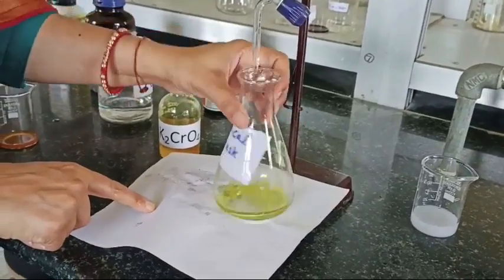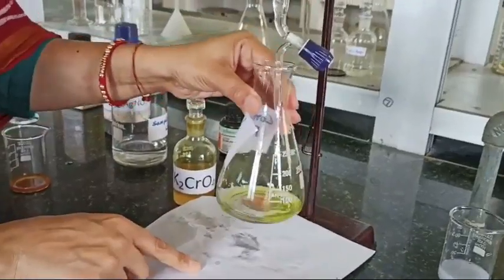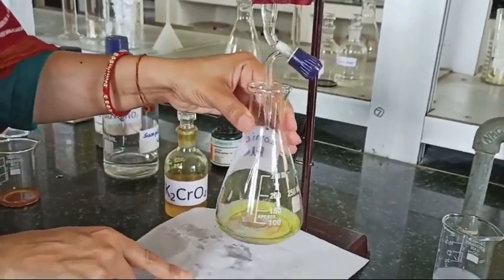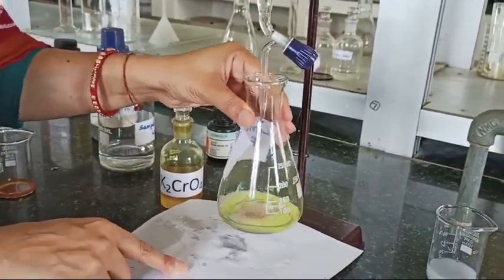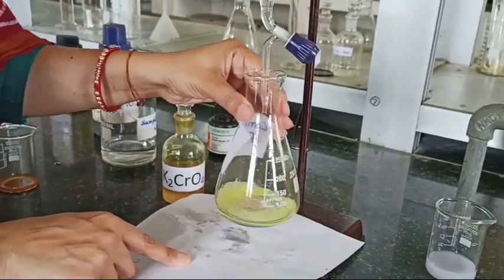Now we will do the same experiment in the presence of indicator. You can see the color. This color is of K2CrO4 will react with the AgNO3 and it forms Ag2CrO4.